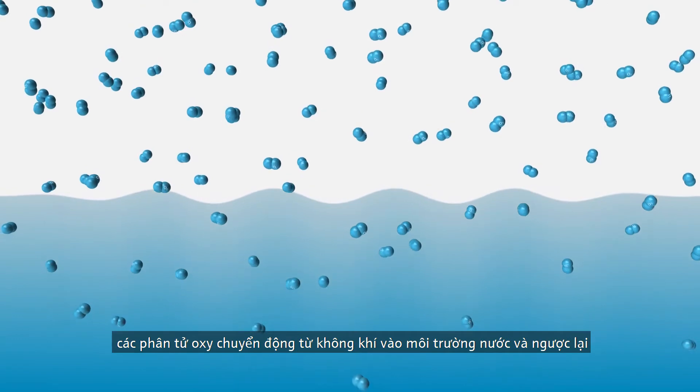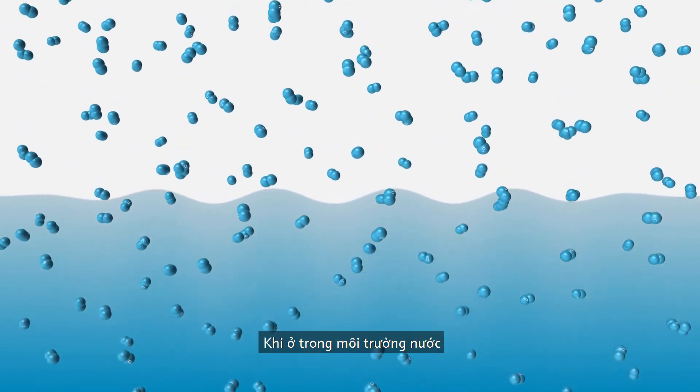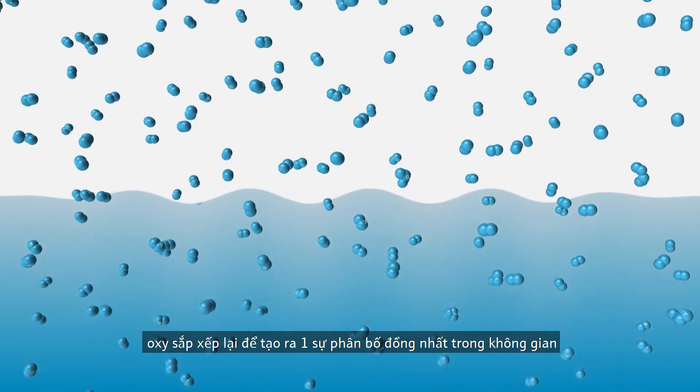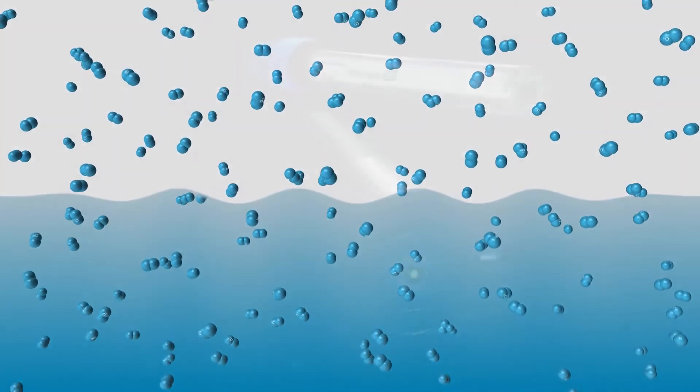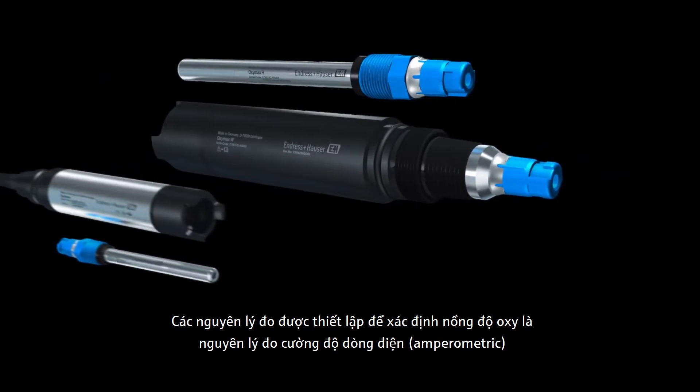Oxygen molecules migrate from the atmosphere into water and vice versa. Once the oxygen is in the water, it distributes evenly to achieve a uniform distribution in space. The established measuring principles for the determination of oxygen concentration are the amperometric and optical measurements.